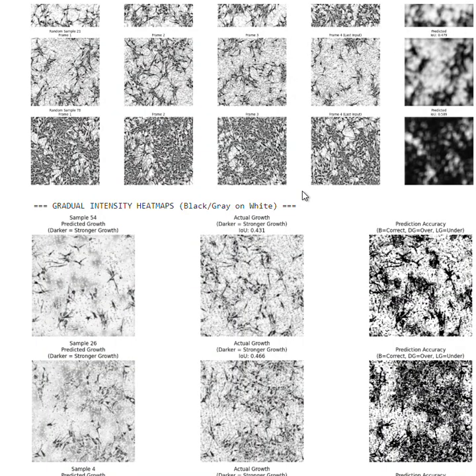So upon using matplotlib, I was able to convert the predicted blurred image into an observable image here. The dark spots, the gray spots which you see here, are the predicted region or the future predictive region, which almost matches with the actual image.